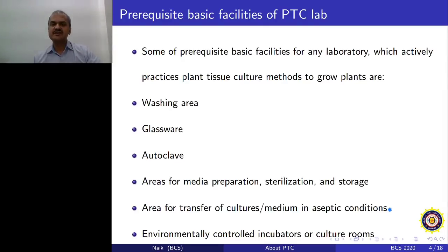Even if it is a smaller size where barely one person can sit in front of that laminar airflow hood, on one side you have say a forceps, surgical blade holder, on the other side you have distilled water, media, test tubes which are sterilized media, and in between if you have a Bunsen burner and a few petri plates and a few test tubes to keep, I think it is possible to establish a tissue culture lab with such a small laminar airflow hood.